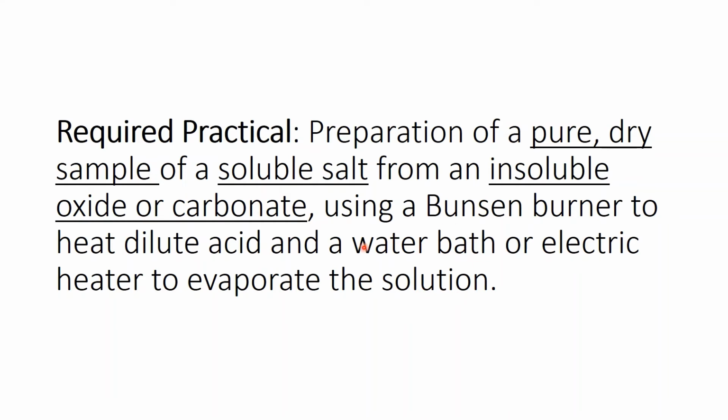A water bath is where you take an evaporating basin and place it onto a beaker of hot water. I'm just going to show you it from an evaporating basin, but either is perfectly acceptable.